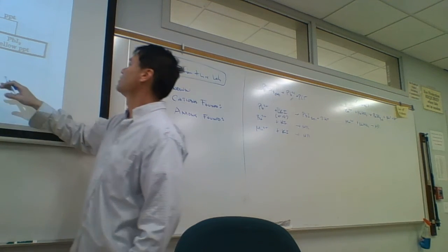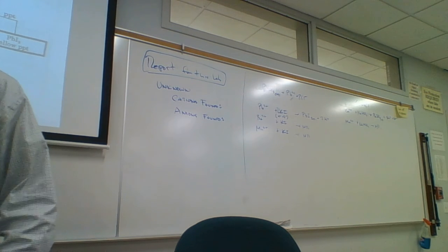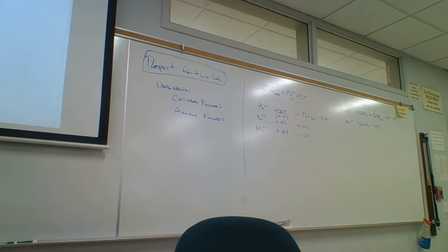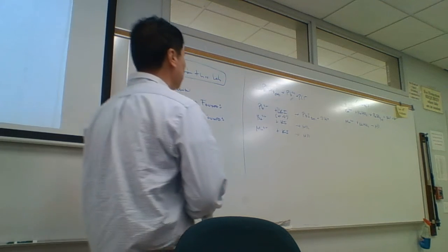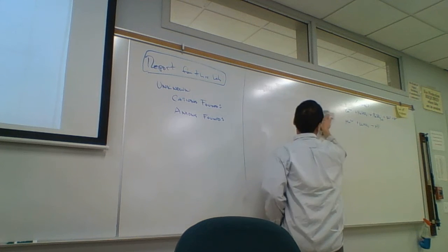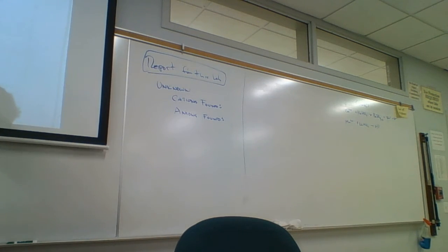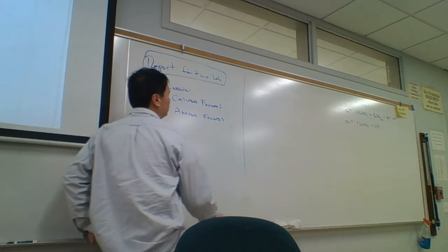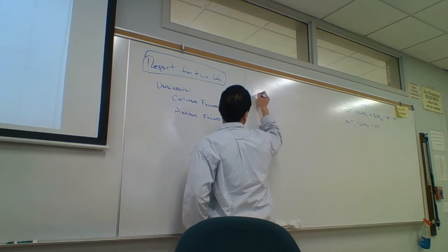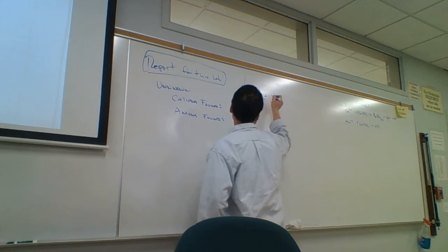And so that takes us to this here. And so now all we're left with is manganese. And so let's take a look and see what happens with the manganese next. So we take that manganese. Manganese likes hydroxide. And so in this next step, we're just going to take manganese and then add sodium hydroxide to this.